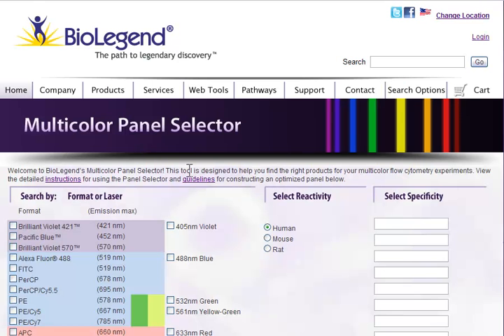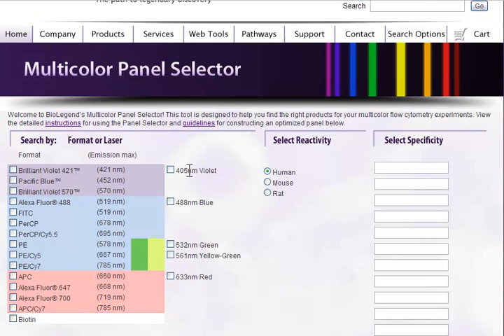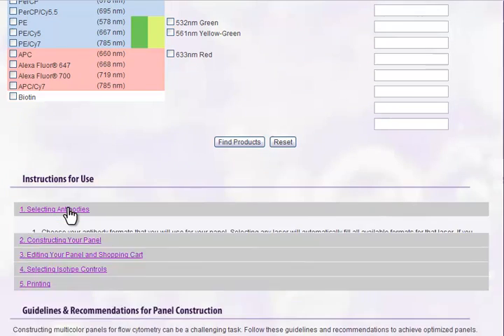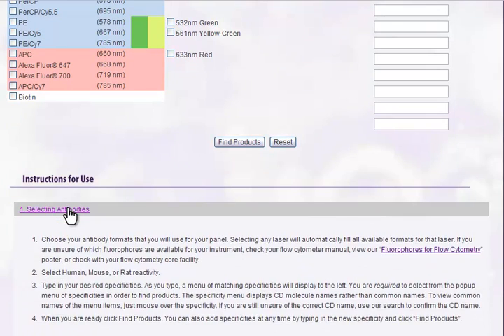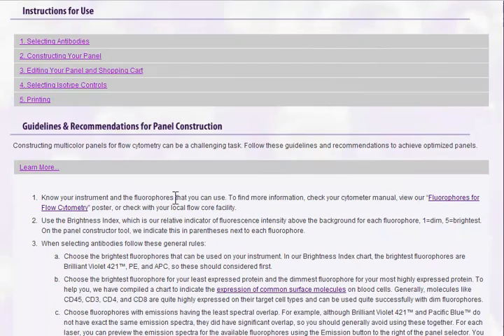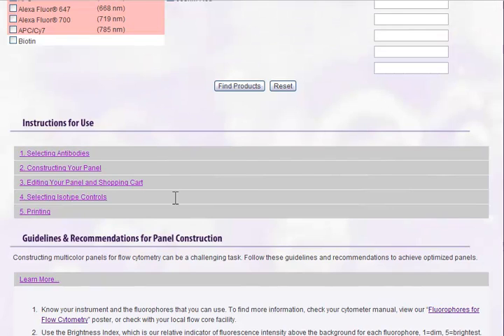Before beginning, we highly recommend that you review the instructions for use, as well as the guidelines for constructing an optimized panel. Click on the sections to expand the details. Once you have read these, you can start to create your panel.